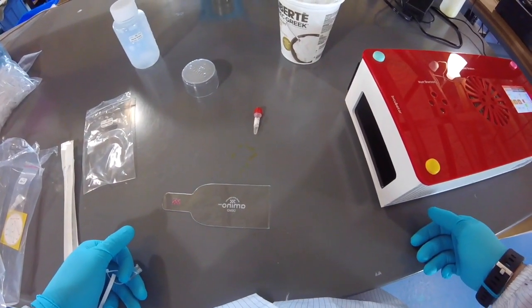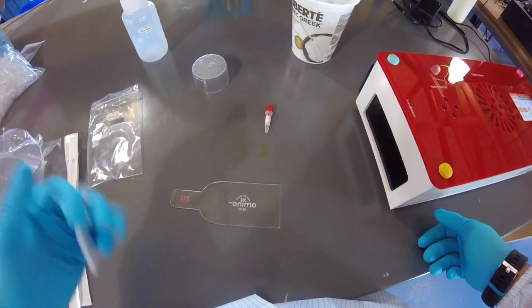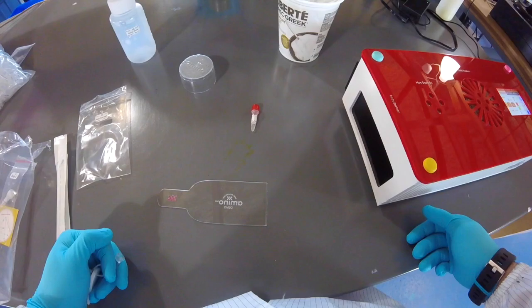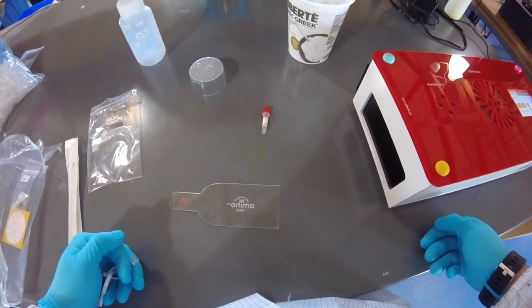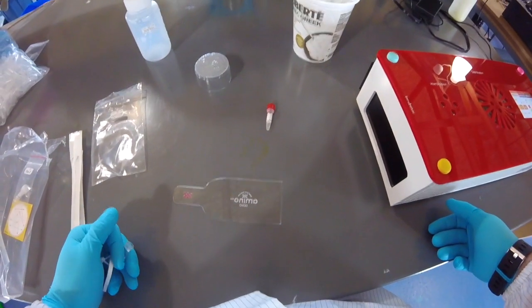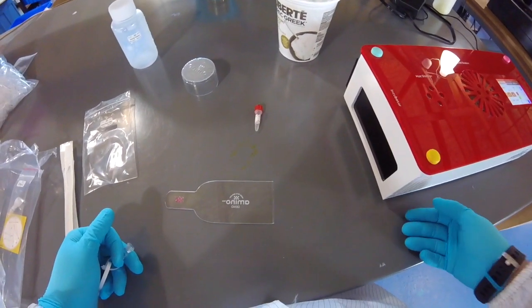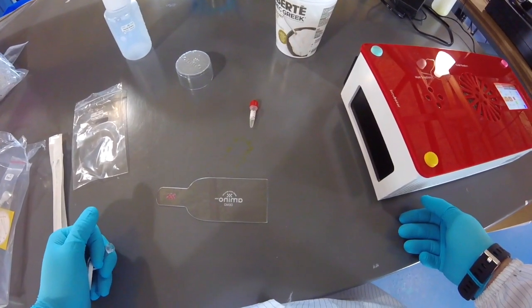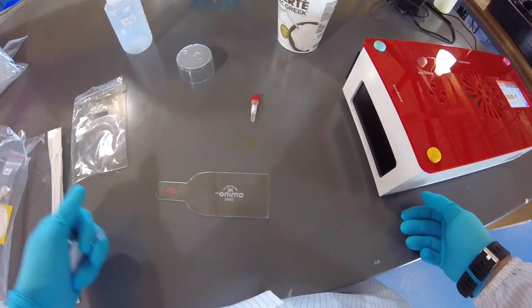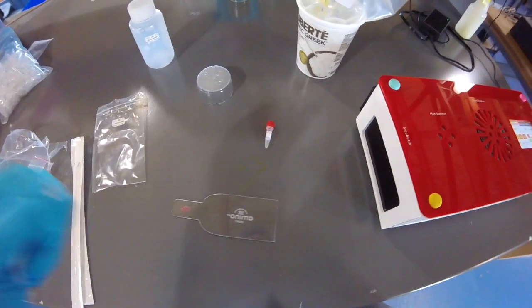And the positive control cells that you used were engineered long before they were put into that tube that you took them from, and so they're kind of in a good state for growing, right? They're kind of ready to go. So when you put them on the plate, they're happy to keep growing on that selective plate, whereas the cells you've just engineered are still kind of in rough shape from the engineering that they just went through. And that's why those will take a little bit longer to grow. All right, so see you in 24 hours or so.